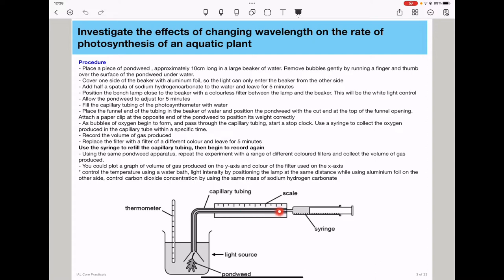We also have a capillary tubing that is going to be filled with water, and as oxygen is produced by the pondweed, it's going to displace some of the water, and the produced oxygen is going to be collected using a syringe. Since we are varying wavelength, we need to make sure that the other factors are constant, like the light intensity should be constant, so we'll position aluminum foil on this side to block any unwanted light from coming into contact with our experiment. This ensures that the light is coming from only one source.